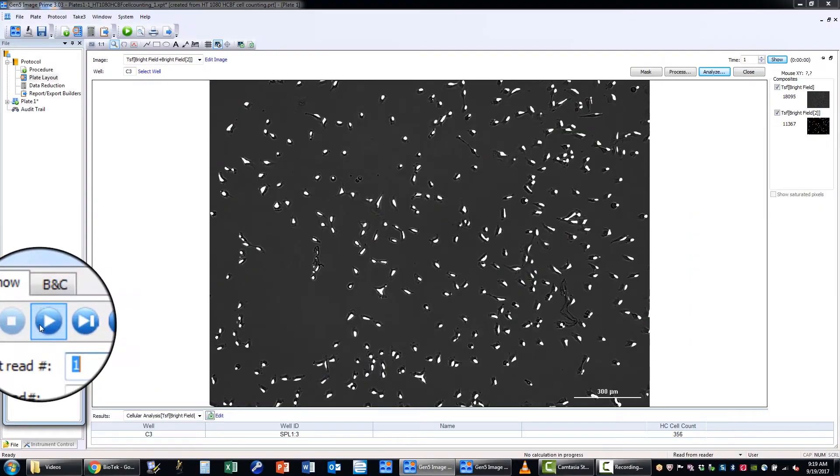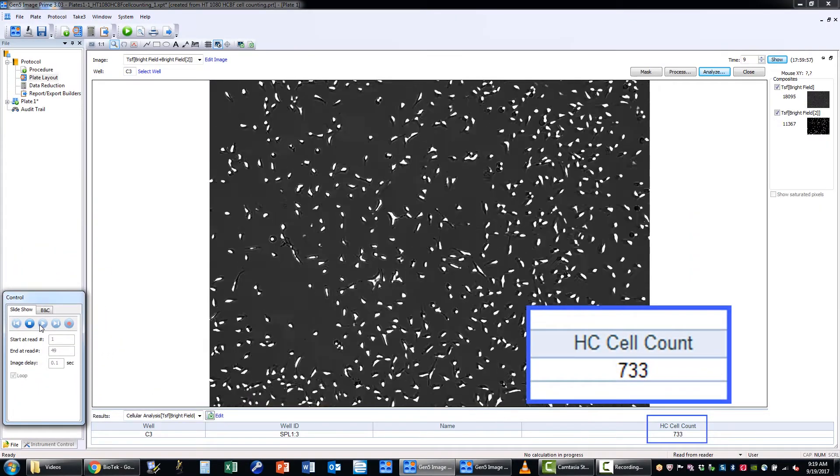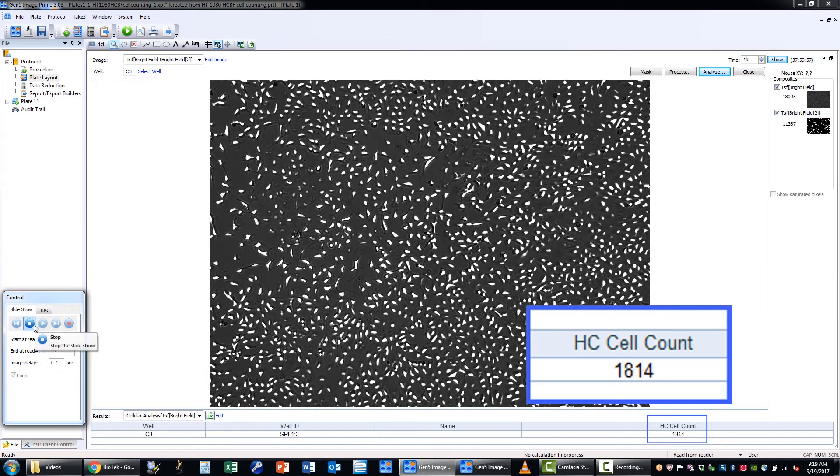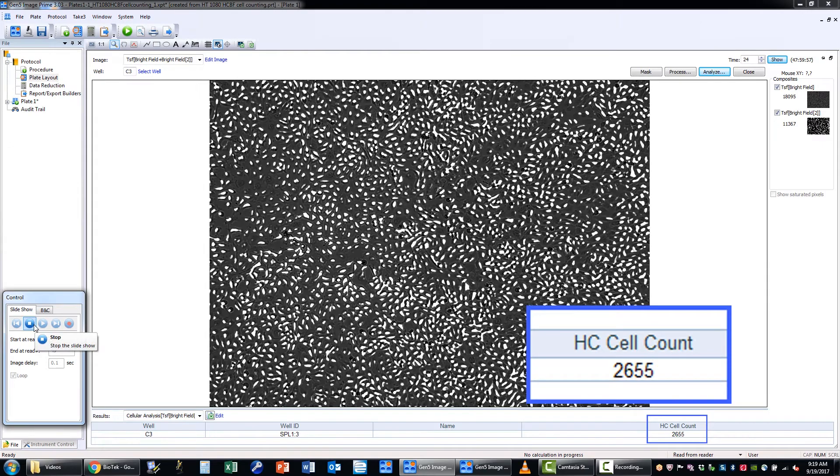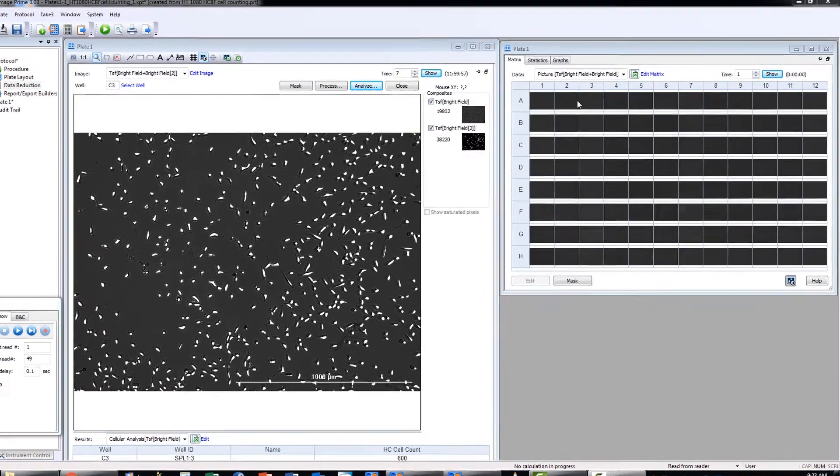After all time-lapse images are collected, the individual frames are automatically compiled into a video clip showing the cell count progress of the entire run.